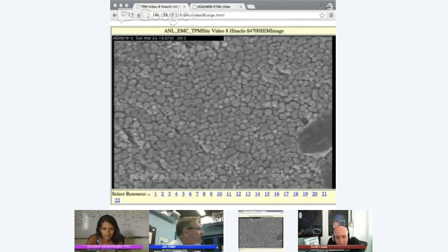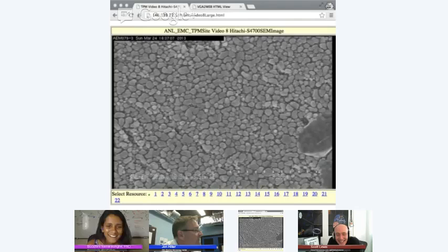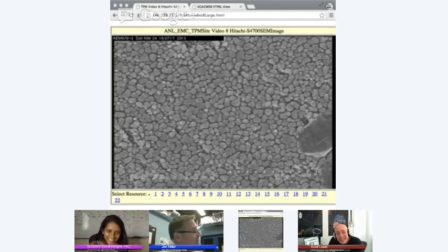Wow. And all of these little guys here, I'm going to do another refresh on the background. So we should have about, what does that say, 957 nanometers? Yes. Okay. So each one of these islands are individual grains of gold. Wow. Oh, my God.